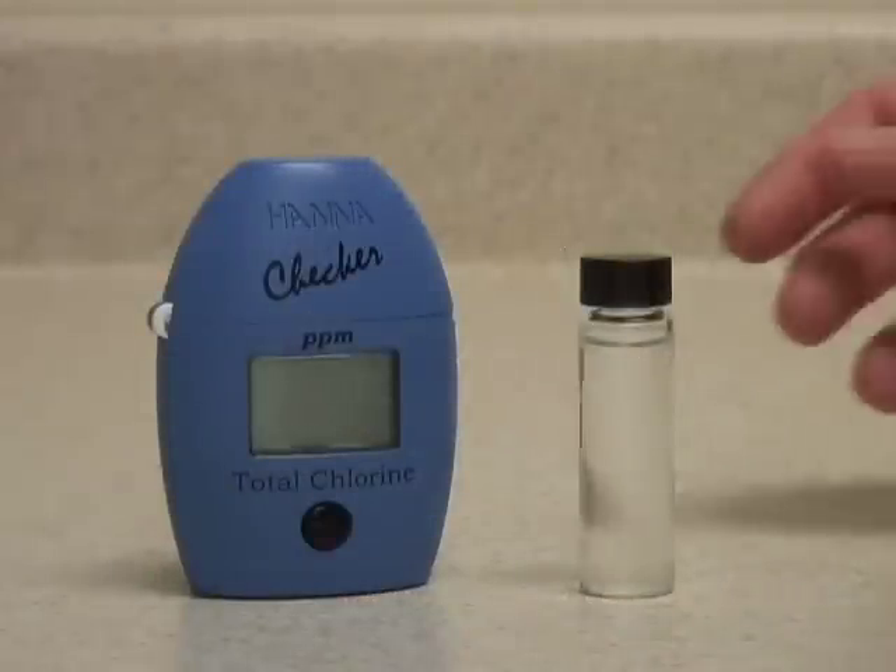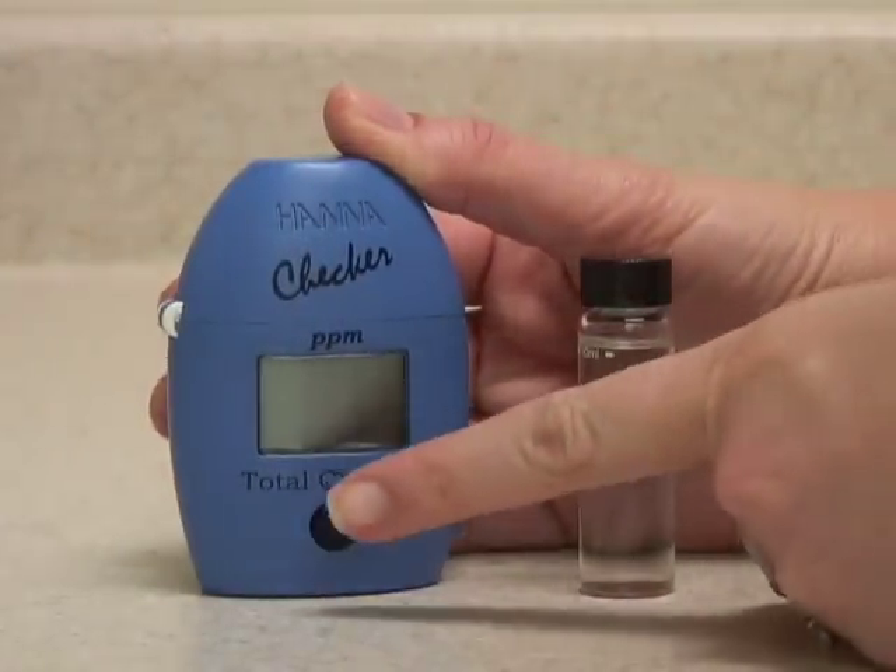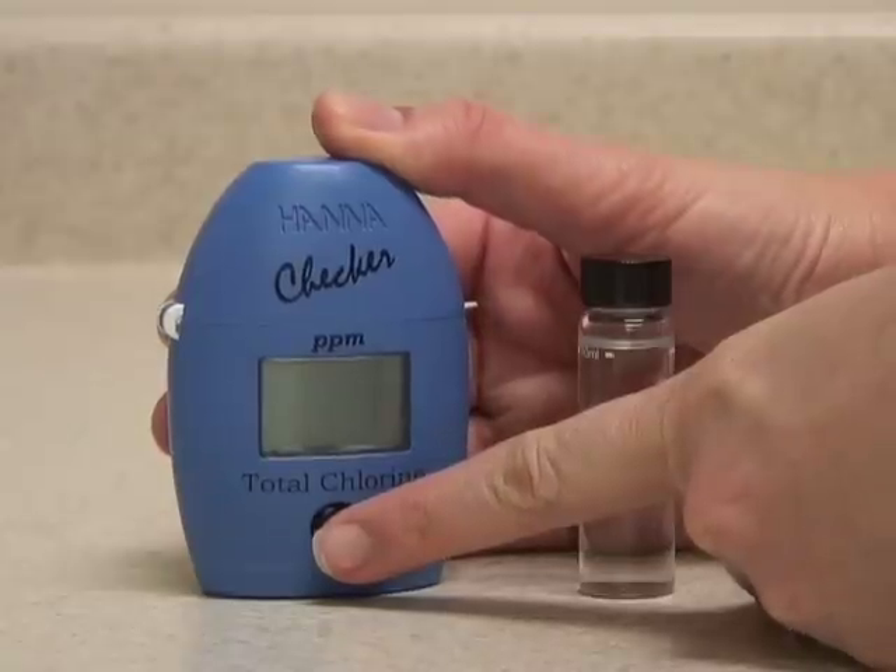This is the Hanna Instruments Checker HC meter for total chlorine. This meter is very easy to use with single push button operation.